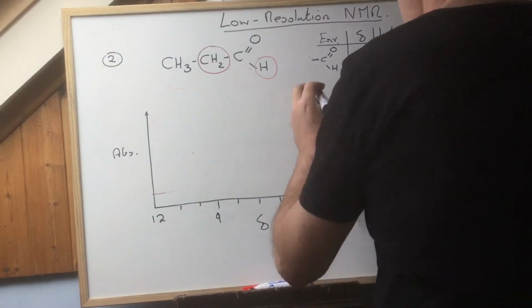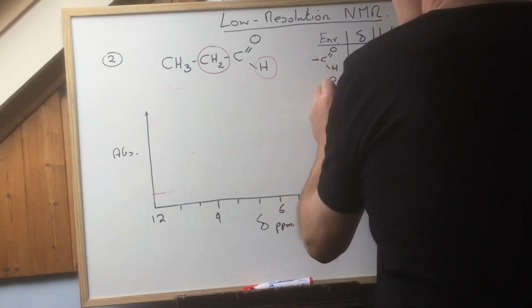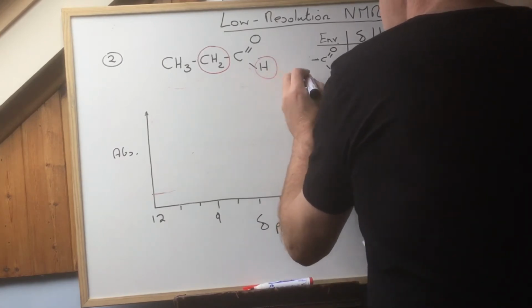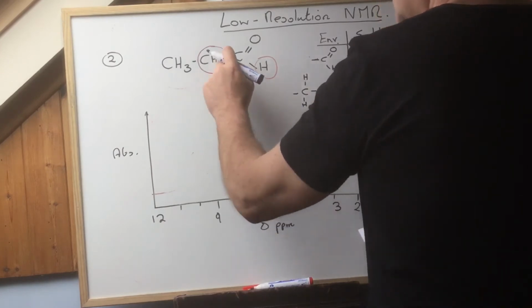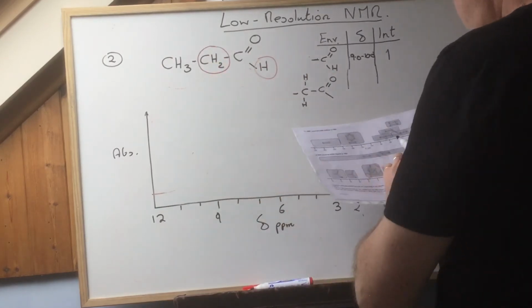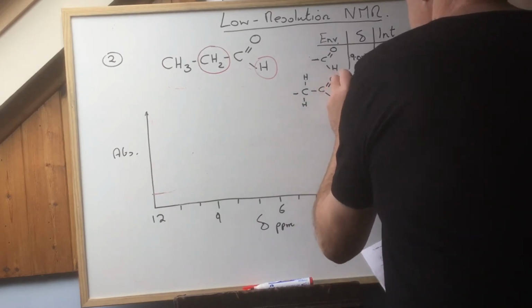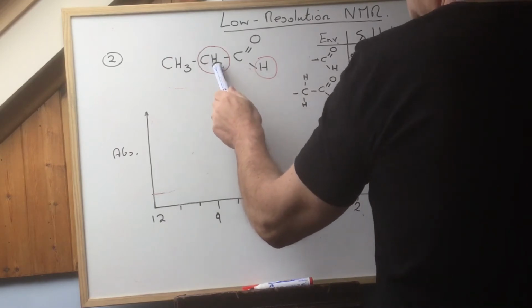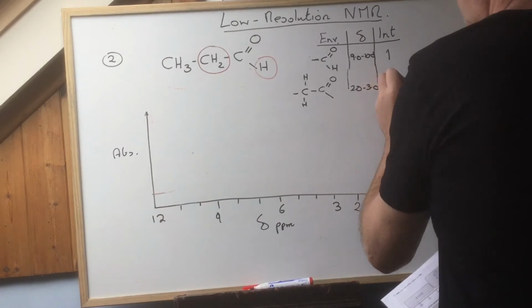So you look on here, and I see this. C, double bond O, C, H's on it. Those 2 there, exactly what we want. Okay, and those are between, I told you this was a popular area, 2.0 to 3.0, and I'm expecting that peak to integrate to 2 because there's 2 protons in that environment.